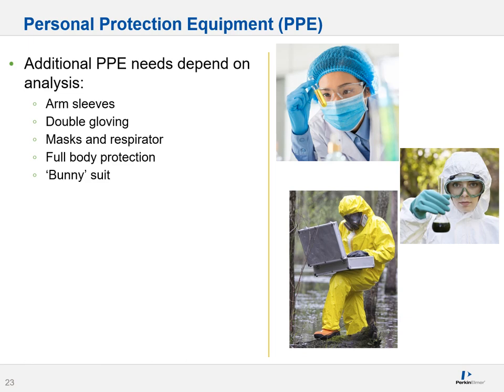Some examples of additional PPE include using arm sleeves to prevent injury or debris contamination. Double gloving — putting a glove on top of a glove — is quite common when using toxic substances such as HF. If you're working in a high dust, bacterial, or antibiotic environment, you might need a mask and respirator. You might even need full body protection for field work. In a semiconductor environment, you will likely need what's called a bunny suit — a full body suit.